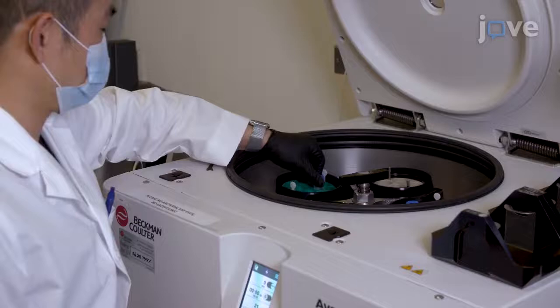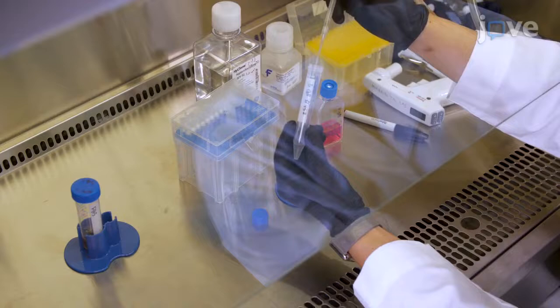Centrifuge the sample at 400 times G for 5 minutes. Then discard the supernatant without disturbing the cell pellet. Resuspend the pellet with 1 milliliter of pre-equilibrated B cell expansion medium.